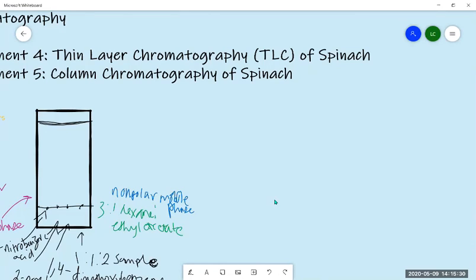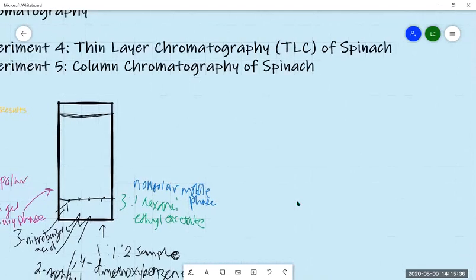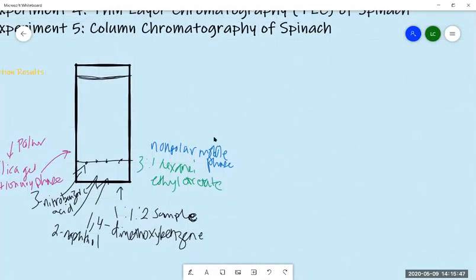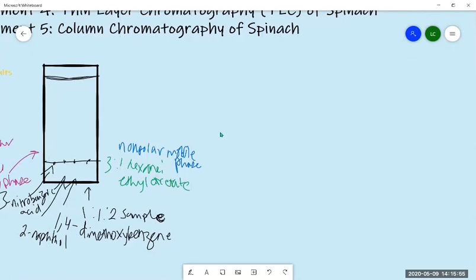Yeah, it tells you about other types of chromatography if you're interested in this. You do these in upper level chemistry classes. So liquid chromatography, gas chromatography, capillary electrophoresis. If you're a chem major or biochem major, you'll do that in upper lab, like Chem 424, 425 lab. Okay, so TLC, enough about that.